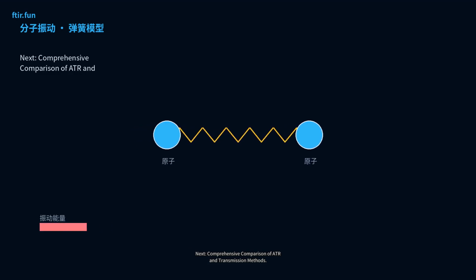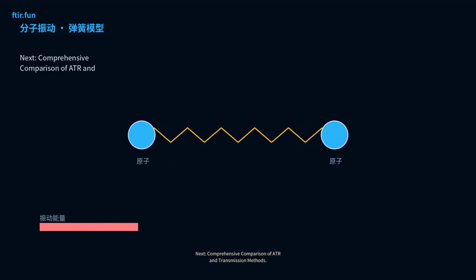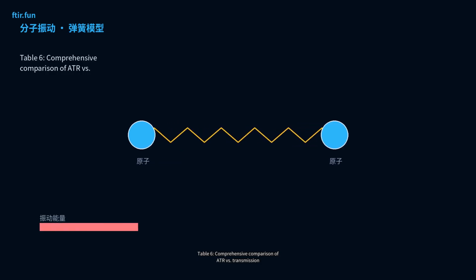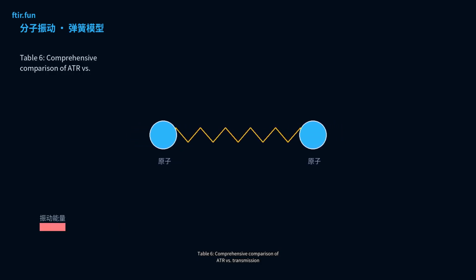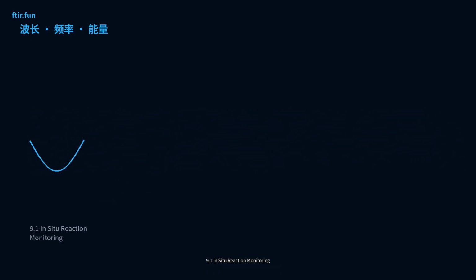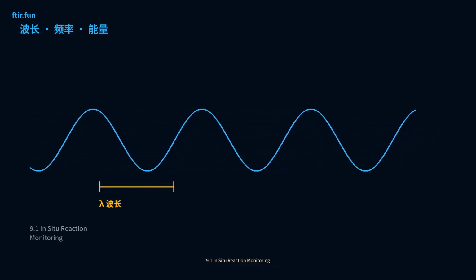Next, comprehensive comparison of ATR and transmission methods. 8.1 Comprehensive comparison table. Table 6: Comprehensive comparison of ATR and transmission. Next, other applications of ATR. 9.1 In situ reaction monitoring.